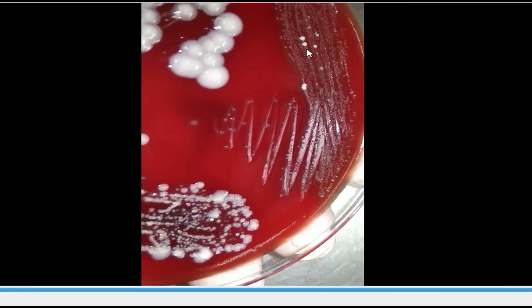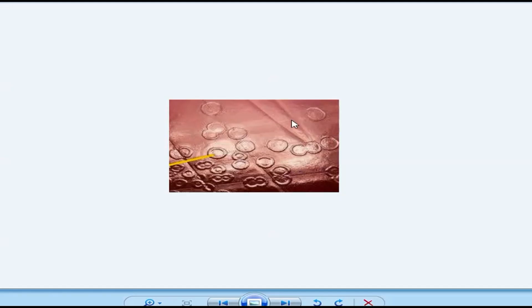After further incubation of this blood agar plate, we are able to get this type of colony. These are clear-cut draughtsman's colonies.